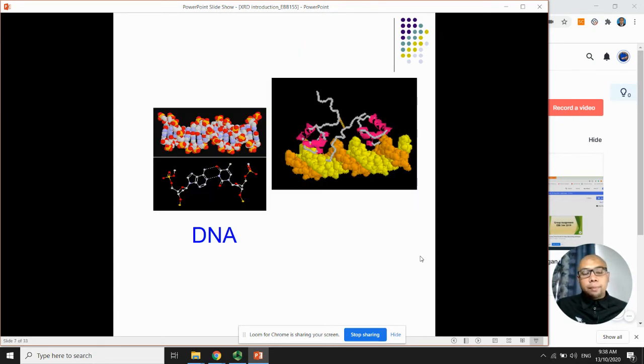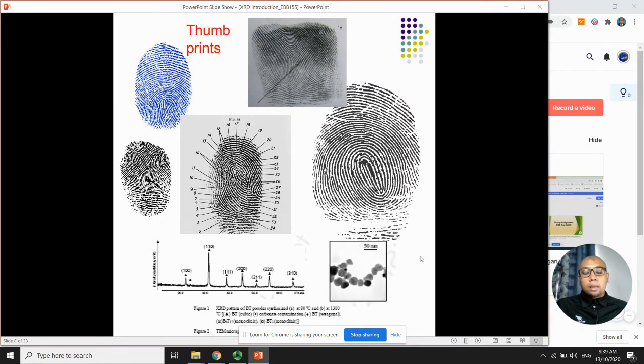For example, as I mentioned before, the twins, triplets and quadruplets: even though they look the same physically, when you get their fingerprint, their DNA is different between each other. I think this is the best way to explain how the XRD principle works.